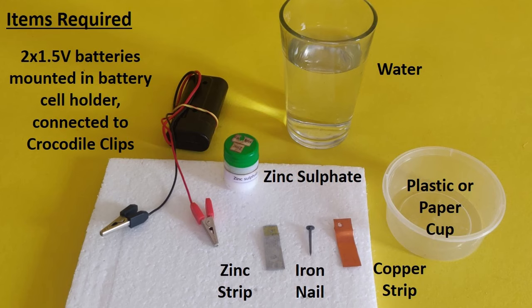For this we will need two 1.5 volt batteries mounted in a battery cell holder and connected to crocodile clips. We will need some zinc sulfate and water to prepare an aqueous solution, a zinc strip, an iron nail, and a copper strip. You can use a plastic or a paper cup to hold the electrolyte.